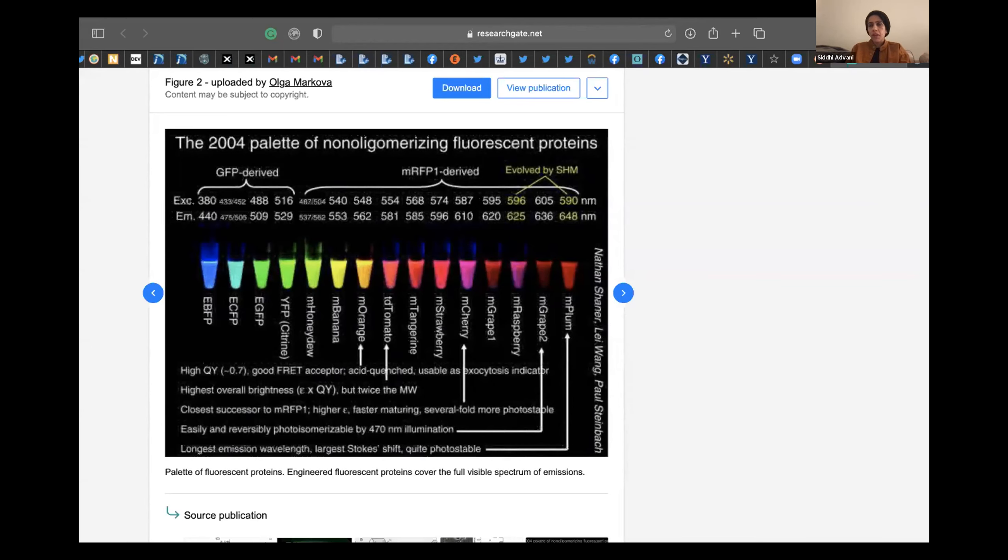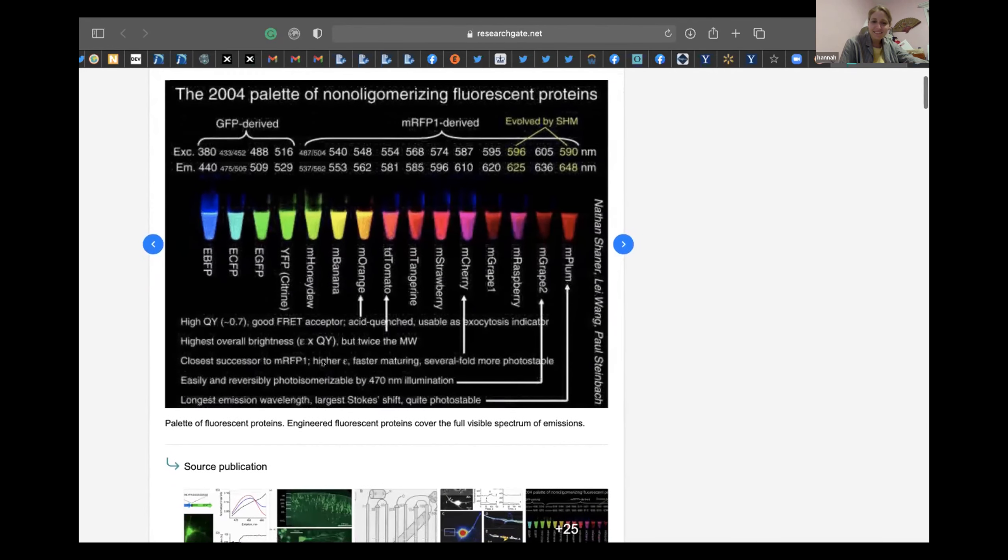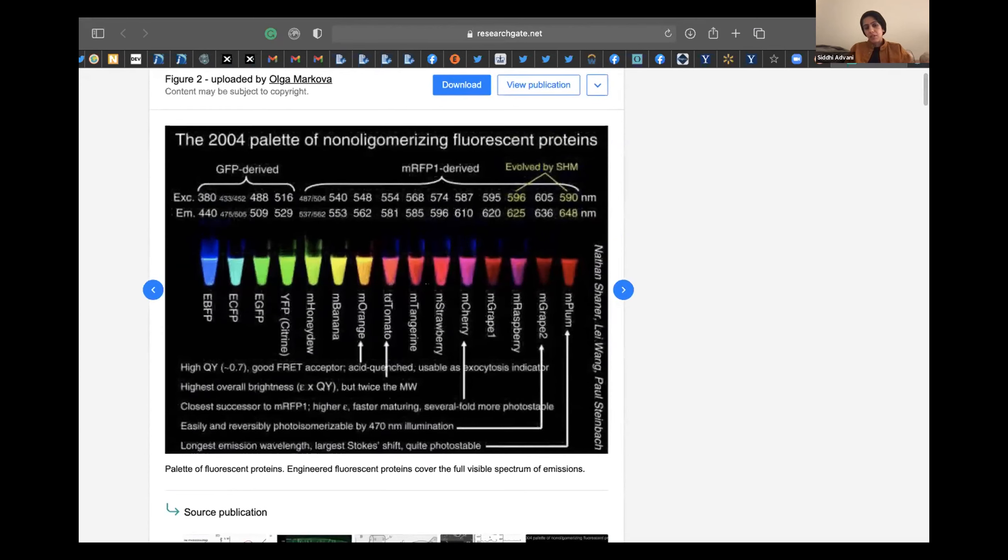They tend to have different uses in research, but also at least for the purpose of agar art. Perhaps Nora can tell me if you know which colors were used. No, they didn't tell us. I think there was their proprietary. Yeah. I guess one was pretty purple. Yeah. So they look, they end up looking pretty, I mean, this is them subjected to UV light. So it's like this is what it looks like when it's glowing in the dark, but when you're just looking at it under regular light, it's not going to look as intense. It's going to look, you know, it's not going to look as emphasized.